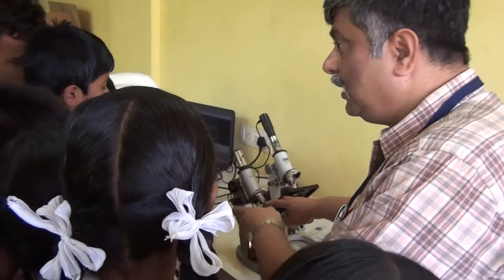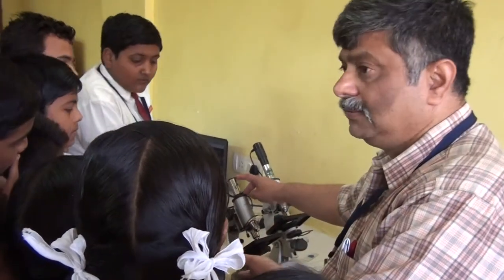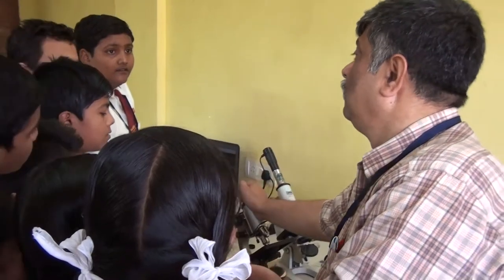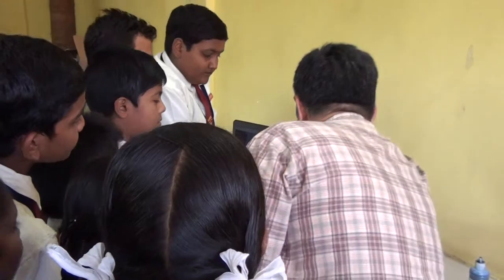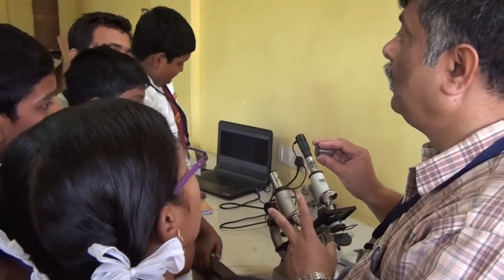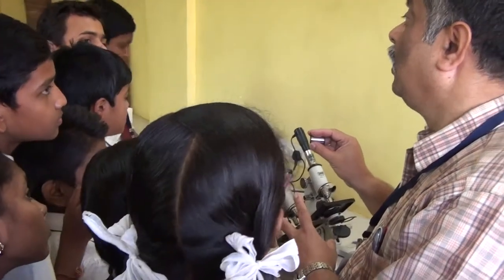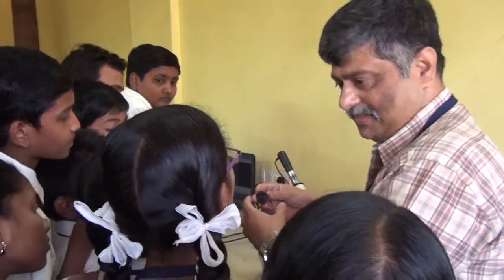What is this? Any of you? Lens, yes, it's a lens. What about this? That is also a lens. Here, I can take it out. It's also a lens. So there are two lenses in a microscope, and that is why it is called a compound microscope, because it compounds two lenses.